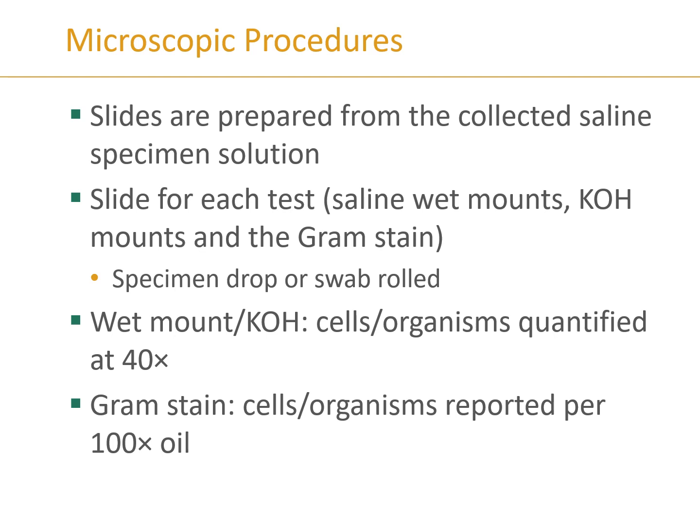Once it's placed into that collection tube with that 0.5 to 1 ml of saline, you can take that swab and roll it on the slide to prepare it, or you can take a drop of that liquid in the sample and prepare those slides. For a wet mount or a KOH prep, we will look at those organisms on a 40x objective, so this is your high dry. And for a gram stain, of course, we would look at that on our oil power or 100x objective.